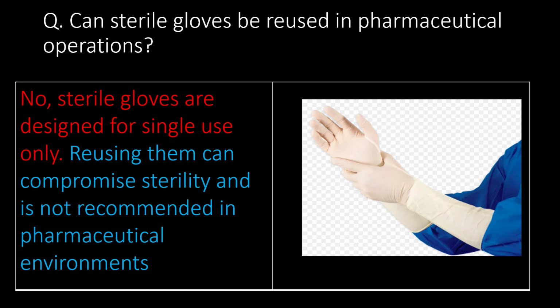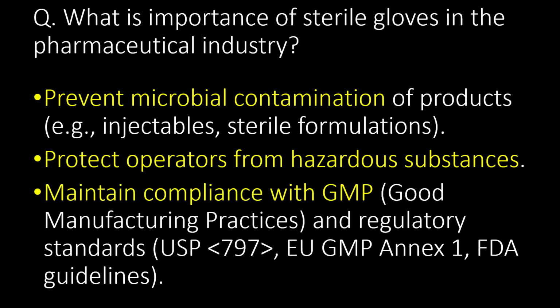No, sterile gloves are designed for single use only. Reusing them can compromise sterility and is not recommended in pharmaceutical environments. Very important question: what is the importance of sterile gloves in the pharmaceutical industry?